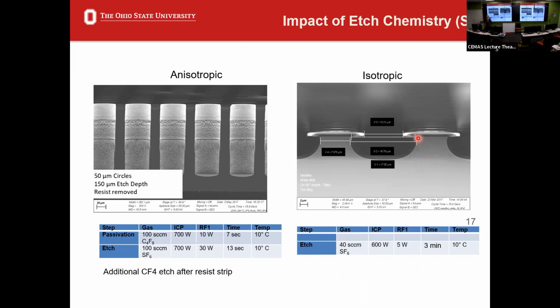The one on the left is very much what we call a physical etch. So you're etching with a physical sort of ion. You guys are doing gallium cleans on some of your FIBs, where we're etching with the gallium beam. It's essentially the same idea, but we're using the chemistry of the plasma and the physical nature of the plasma to tailor that etch. The one on the right is an isotropic etch, and it's really just all chemistry. You can see you get this UFO structure, and you're undercutting and getting the bowl there. In this case, that's what they wanted. What they're trying to do eventually is make that top surface come up into a needle point, so it can actually penetrate skin, like a skin patch typically.